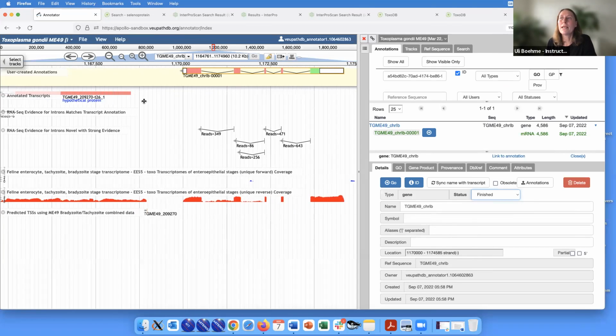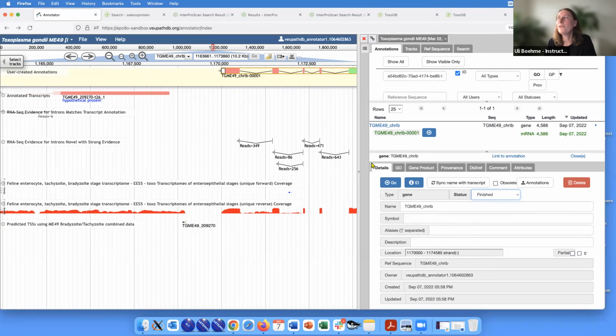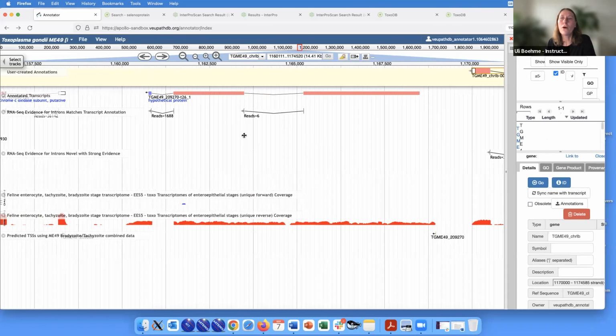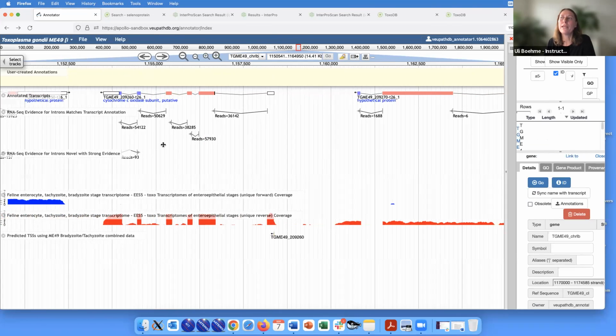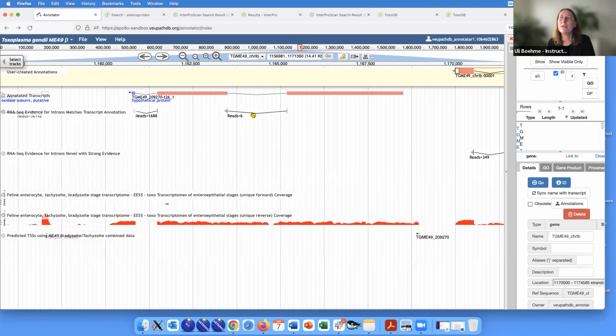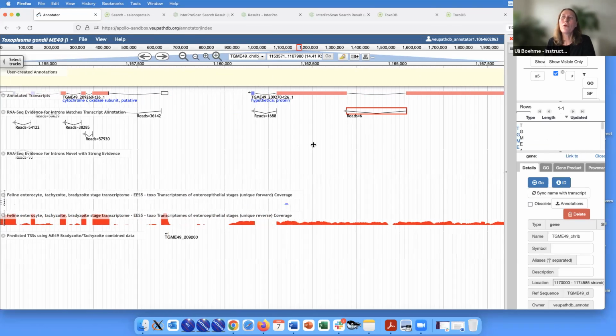Just one last thing to say, and Oma mentioned that already too. If you're working on a genome, you can of course scroll along and check for incorrect gene models. And one, for instance, is here. Can you see here? Looks as if this should not be an intron, but a very long exon. So you can scroll along.